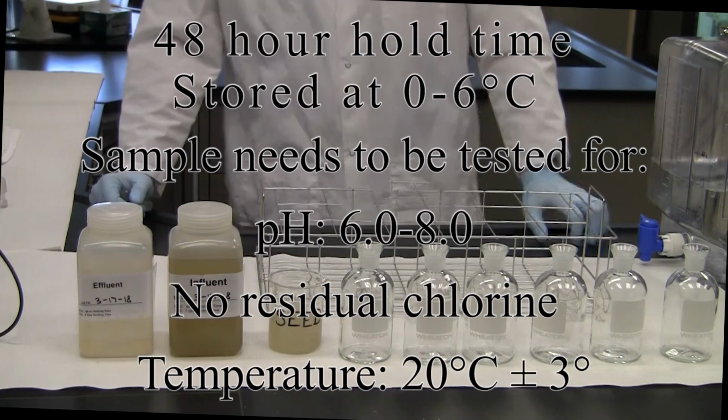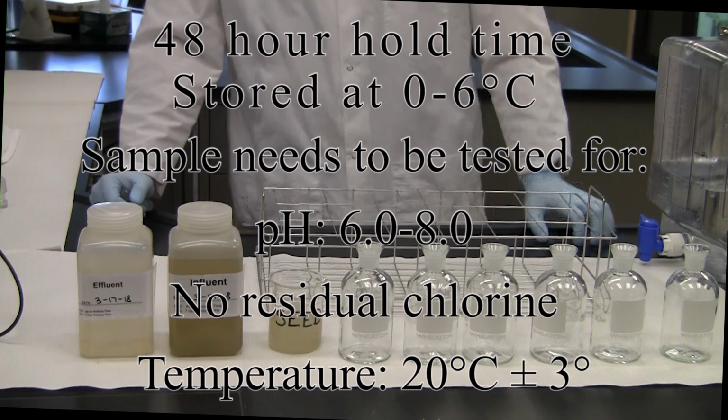Sample preparation. Every sample needs to be run within 48 hours of collection and needs to be stored at 0 to 6 degrees Celsius. Each sample needs to be tested for the following. pH needs to be in the 6 to 8 range, but if it is not, it must be adjusted to 7.0 to 7.2. You may use 1 normal sulfuric acid or 1 normal sodium hydroxide to bring the pH into range.